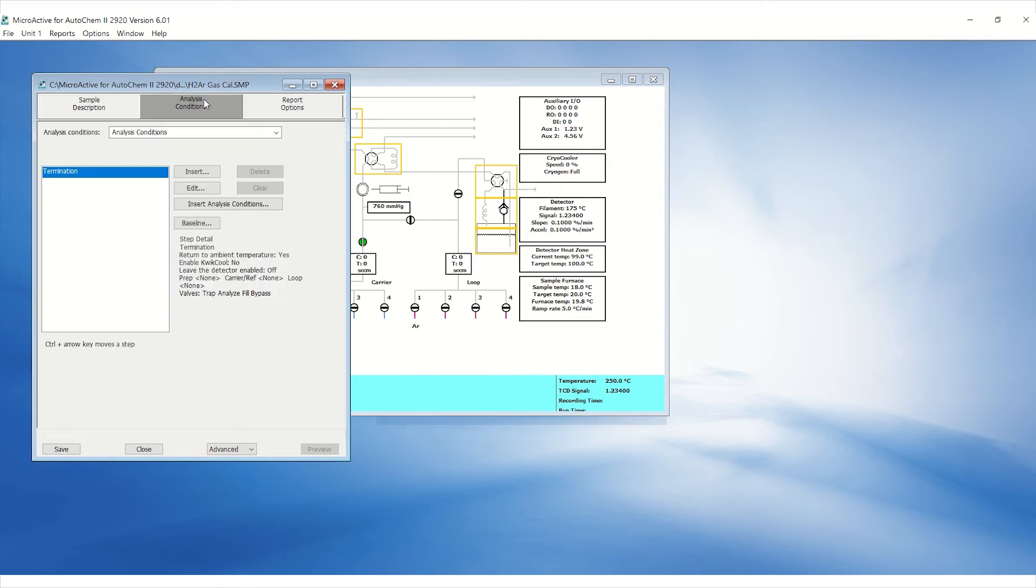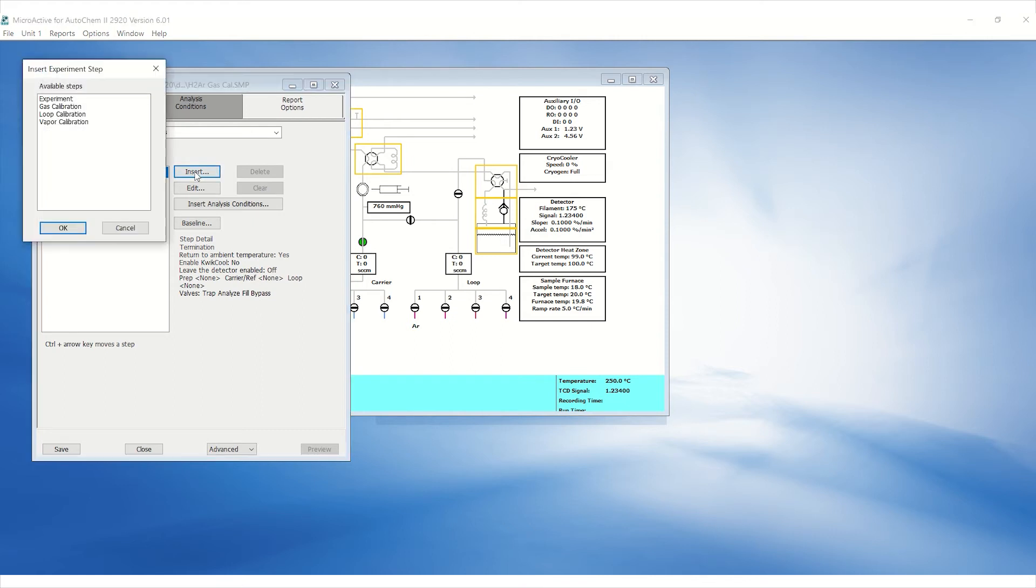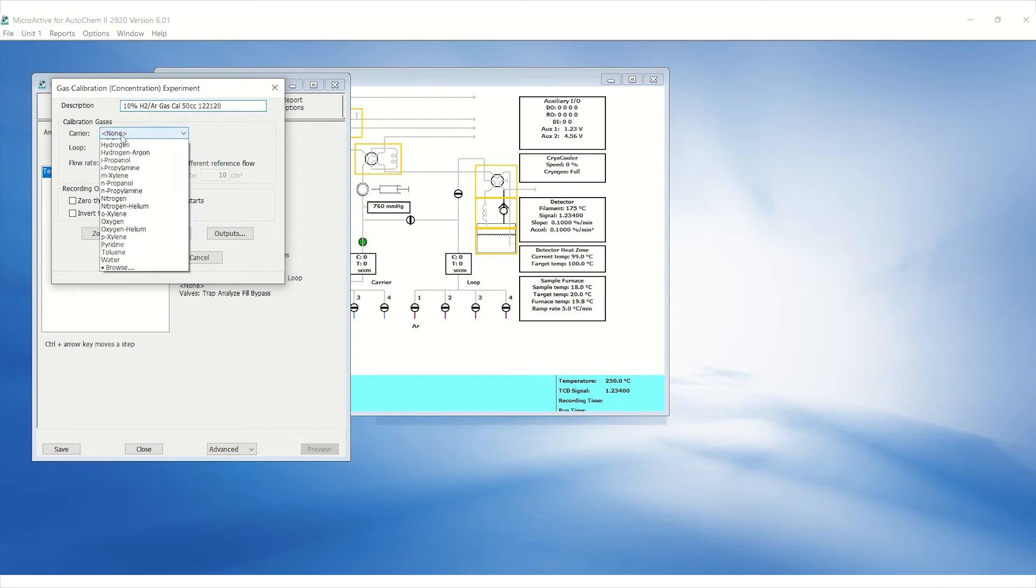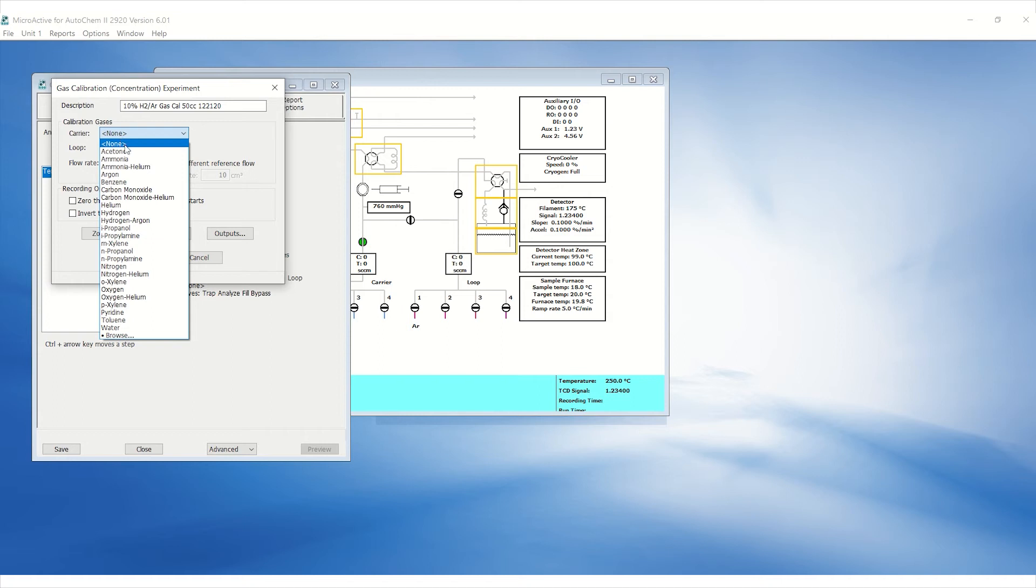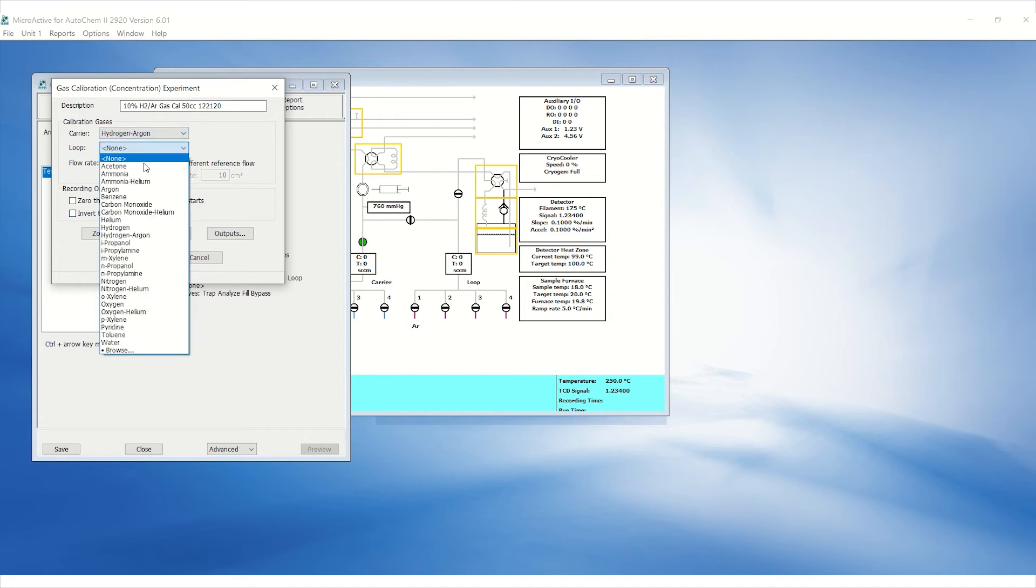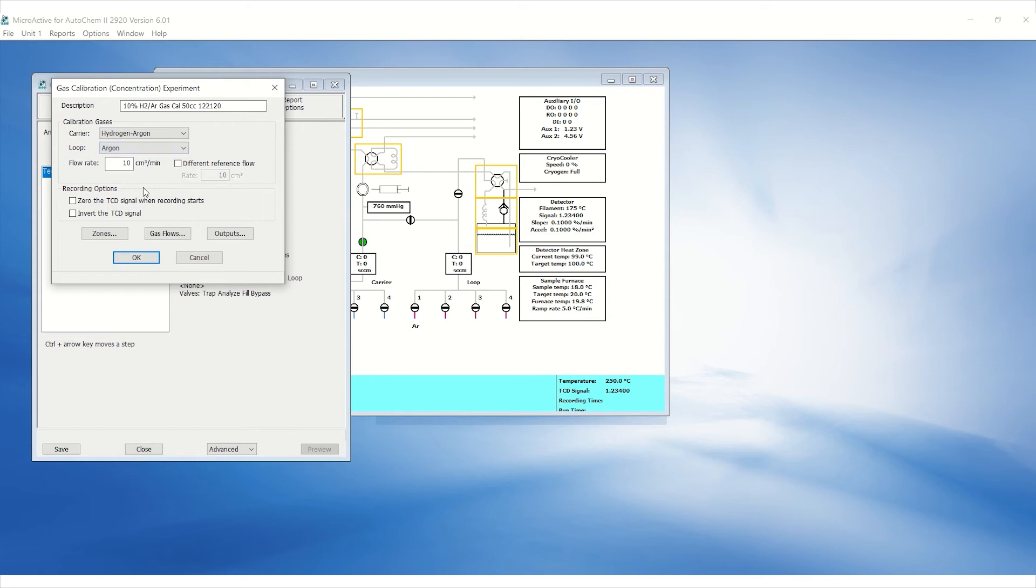Click on the analysis conditions tab. Click on insert and then gas calibration. Type in the descriptions of the calibration, including the active gas percentage, gas blend, flow rate, and the date. Select the carrier and the loop gas of your choice. Then enter the flow rate. Make sure the carrier gas of the calibration matches the carrier gas of the experiment.